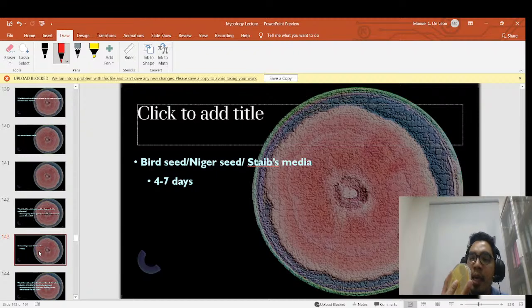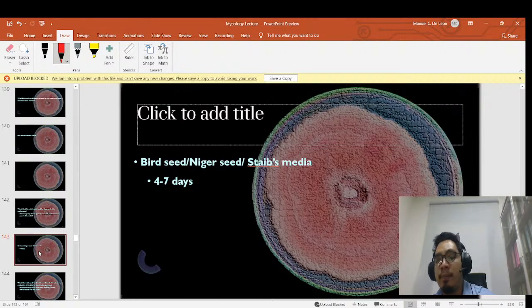Actually, this one is incubated for 30 days in our protocols. In order to avoid drying of this one, we put it in a biohazard bag and then just leave it out at room temperature. It's not really an incubator, but there's supposed to be an incubator for this one, so as to avoid spore transmission towards other coworkers who just wanted to visit a microbiology laboratory.